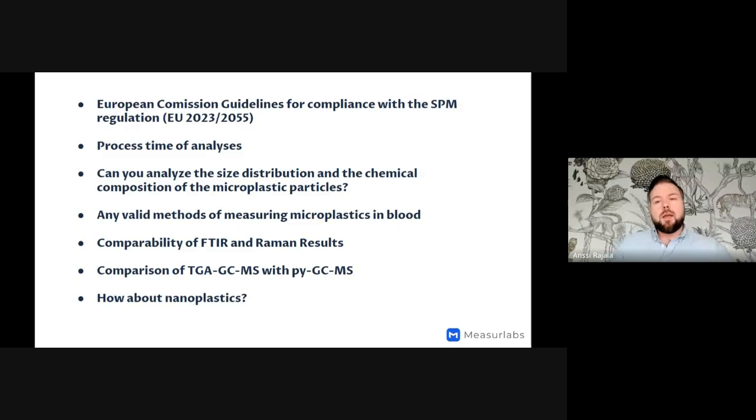We can at least provide sampling instructions on paper or PDF, and we are also able to help to source suitable sampling equipment and suitable sampling bottles, for example. We don't currently provide those usually to our customers, but I think this is something that we will be looking into in the future.